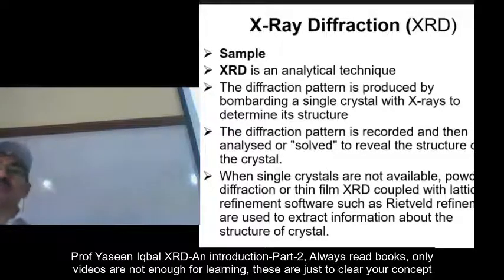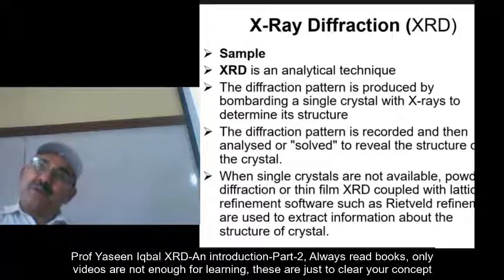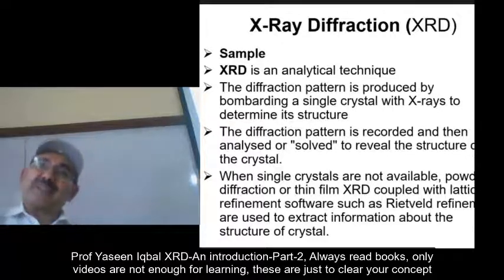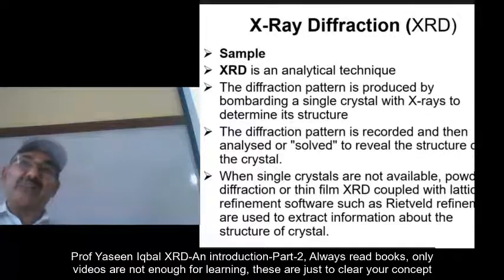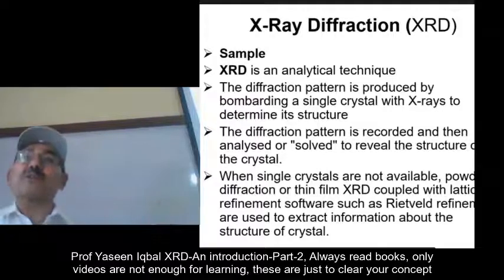I usually use new paper to pour the sample onto. When it is new paper and there is no dust upon it, then I pour it into the bottle. Then you pick the sample with something clean, very clean, onto the sample holder. The sample holder should also be clean.